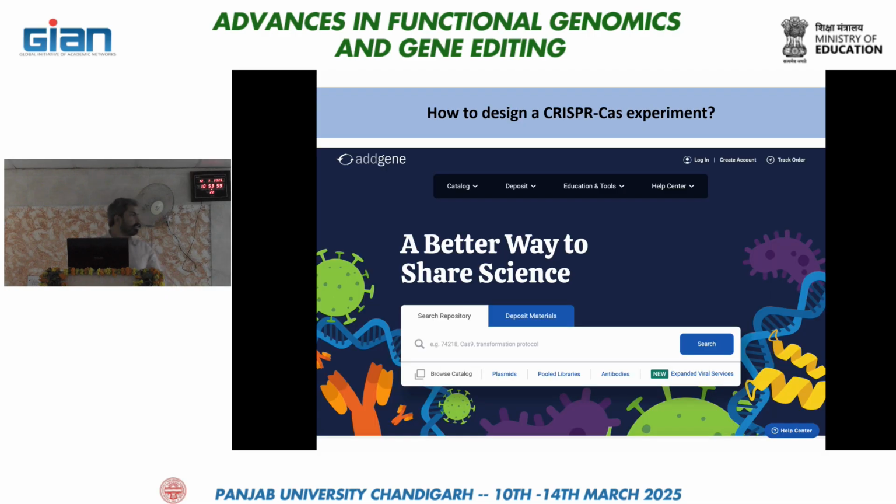So where can you get these specific vectors? There are various repositories available online where you can purchase these specific vectors based on your requirements, and one such repository is Addgene. You all can just type Addgene in Google and click the first link, and then you will reach this homepage.